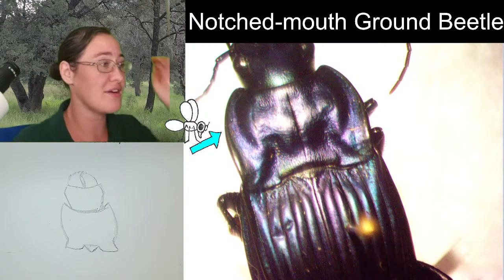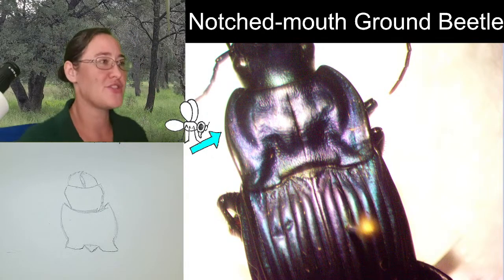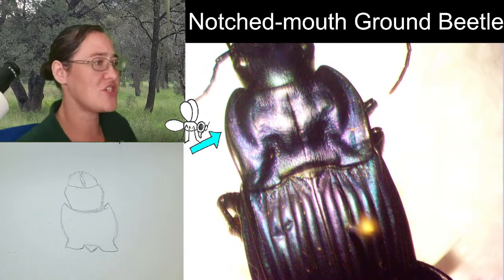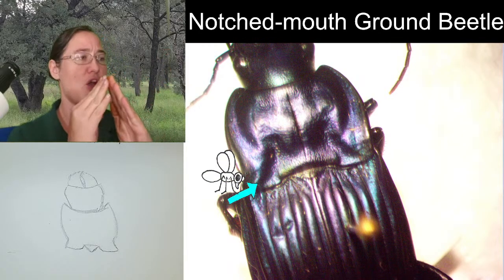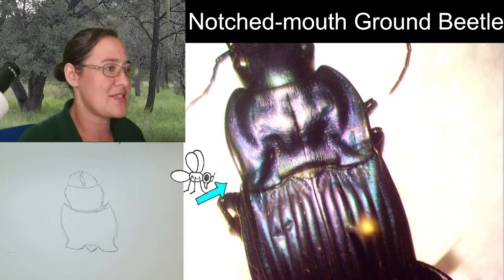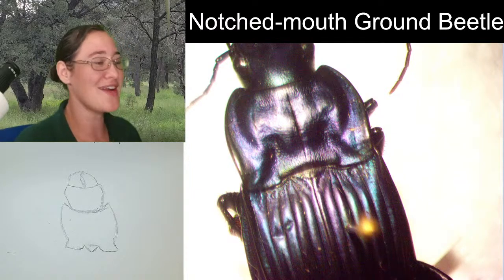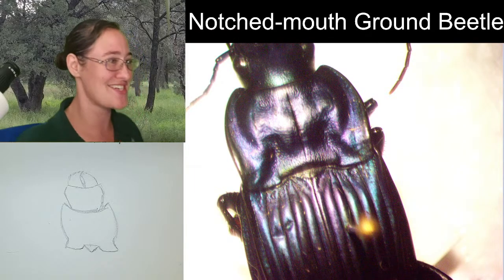And then the second characteristic that's going to help you identify it, because the body shape gets you to subfamily, and then to get it to this genus, you notice that the edges of the pronotum here and here overlap the elytra, and that's going to help you get down to genus, and then to species. It's purple. That's what I kept getting when I was like, how do I know I've got it to the right species? Well, it's metallic purple. Everybody else in the genus is not.